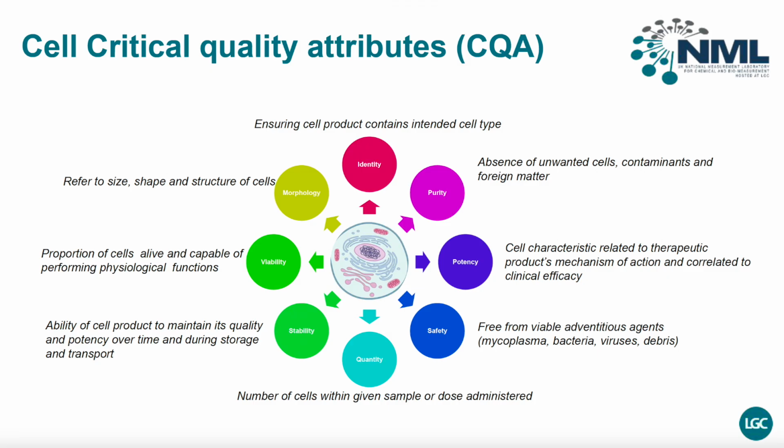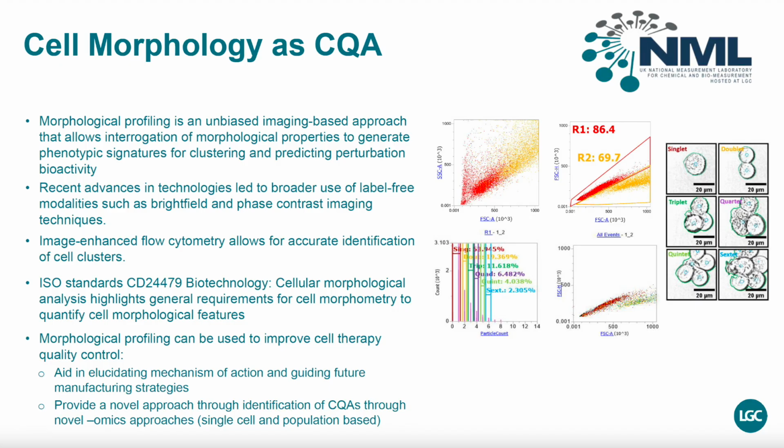In particular, I wanted to focus in on morphology, as this is the topic of discussion in this talk, that refers to size, shape, and structure of cells. I will also be delving into and mentioning aspects of viability and also quantity. So what I mean about cell morphology as a CQA is mainly morphological profiling and its emerging role in cell therapy quality control.